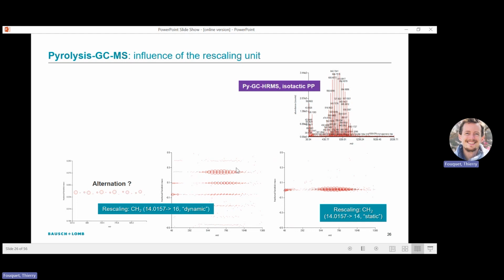You get this interesting expansion, spreading of points along the y-axis. But if you look at the series, you have this weird alternation: big dot, medium size, small, medium, big, small, medium. And it's clearly not lining up horizontally. You have a bit of waviness here.